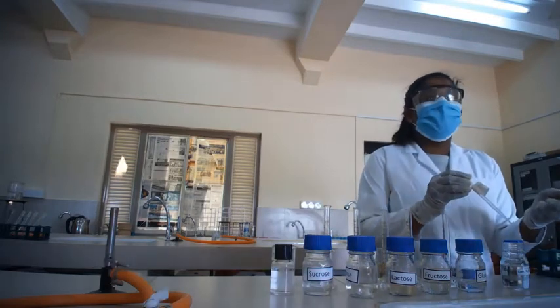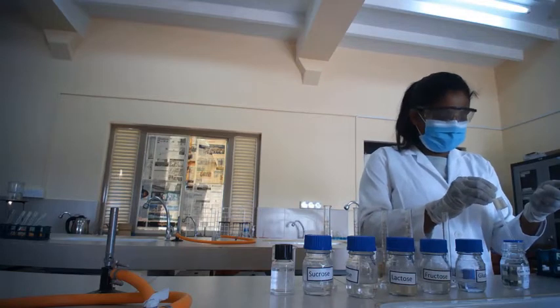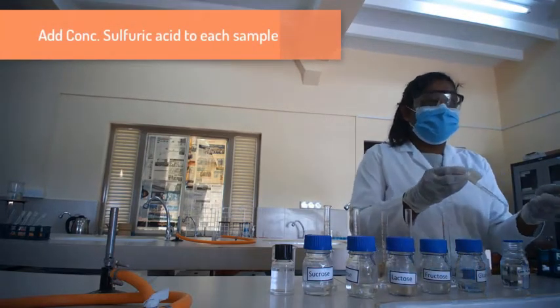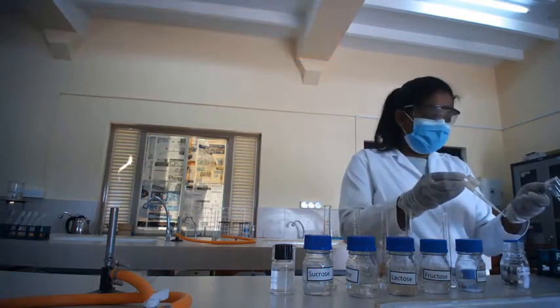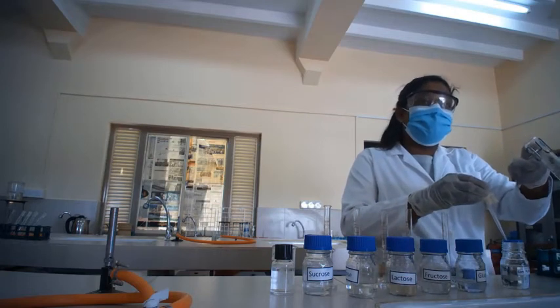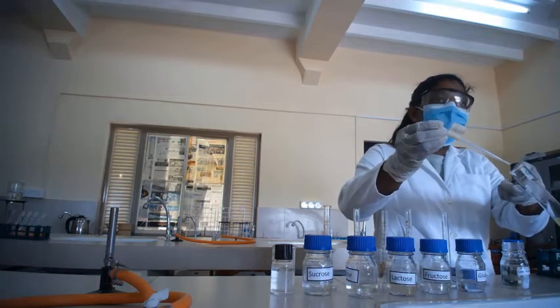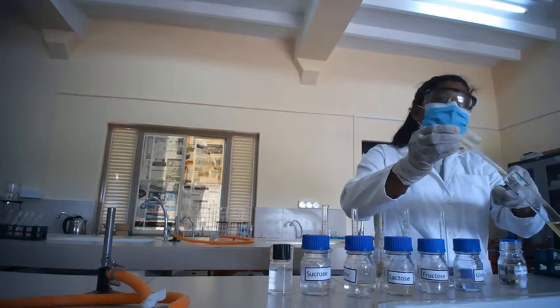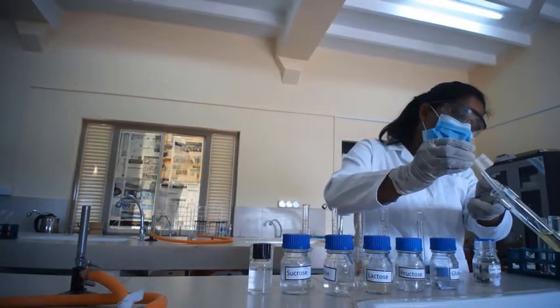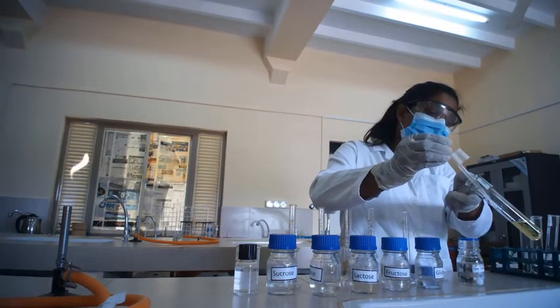Next, you are going to add concentrated sulfuric acid to the sugar solution. When you add sulfuric acid, make sure that you add it along the walls of the boiling tube, and make sure that you add this dropwise, not in a flow. And observe the color change.